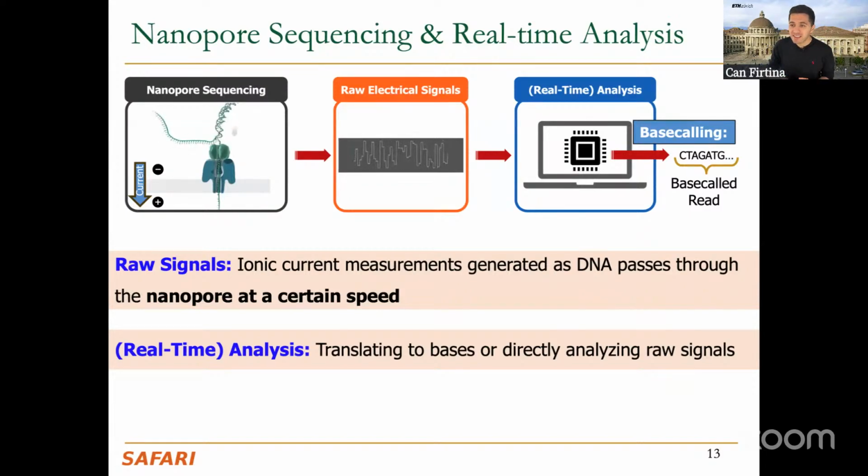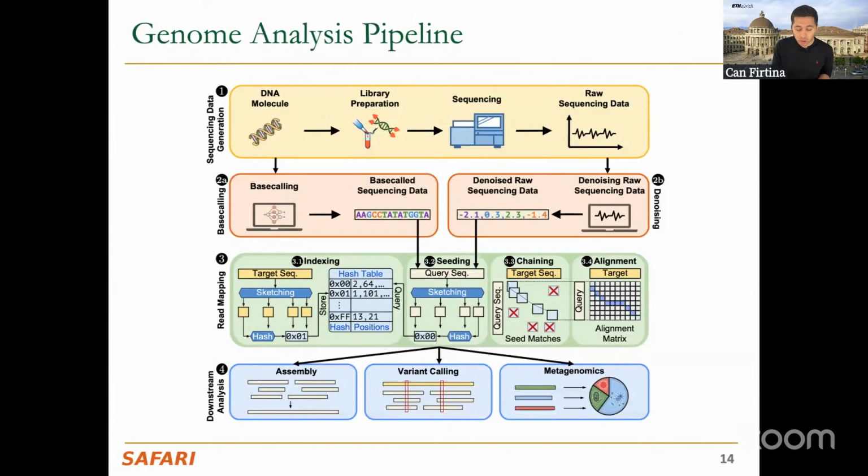So you will start ejecting this read from the nanopore, and since it won't have the necessary adapters, the motor proteins, and so on, it won't necessarily attach again to these nanopores. Once you eject it, it is relatively safe to assume that it won't reattach to the nanopores again. This is basically called adaptive sampling, and this is useful for many reasons.